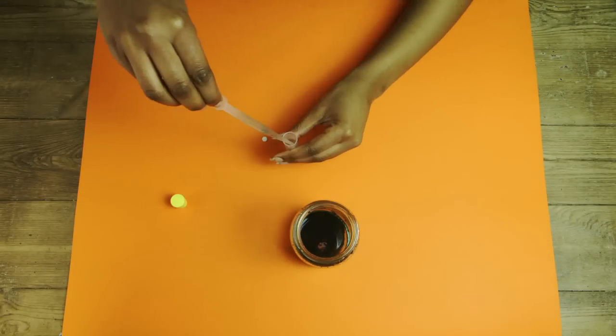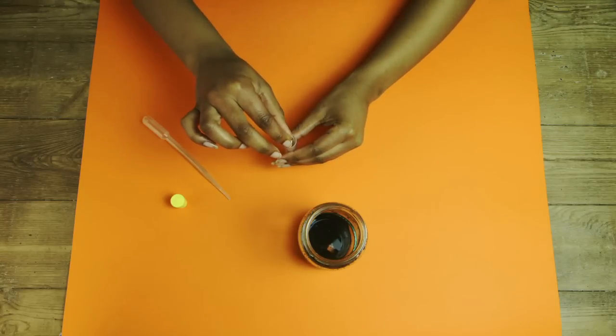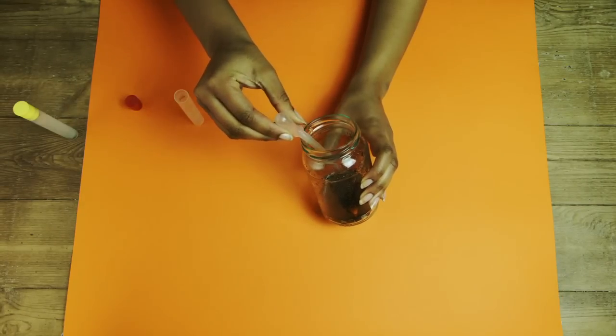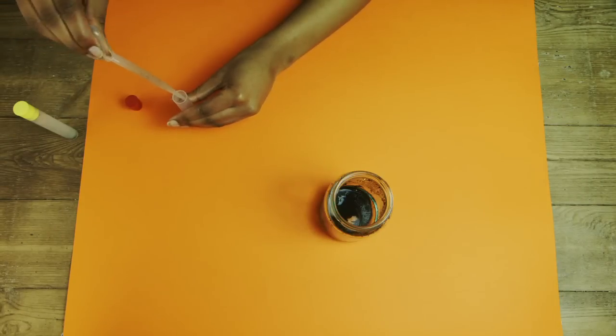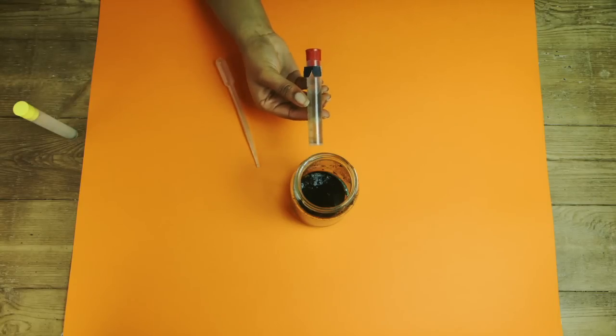Using the pipette, fill the yellow test tube with water from the jam jar. Drop in the potassium tablet and shake it like a Polaroid picture for 2 minutes. Now do the same again for the nitrate test tablets using the red test tube. Nitrate tablets are UV sensitive, so this test should be performed indoors.